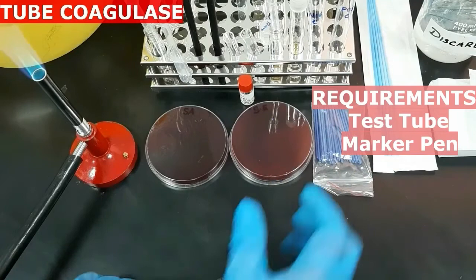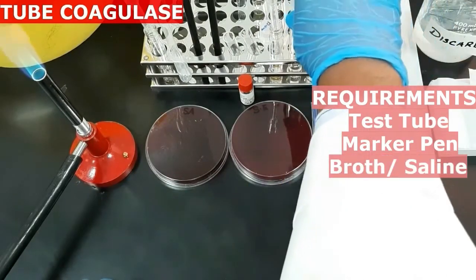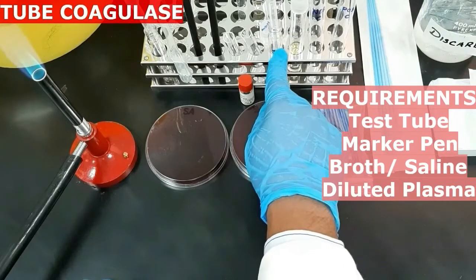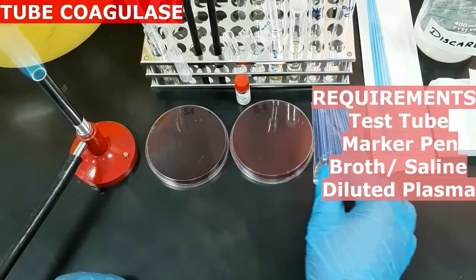Then we need saline or broth, then diluted human or rabbit plasma, then disposable loops, a dropper, and the positive and the negative control bacteria or the test bacteria.